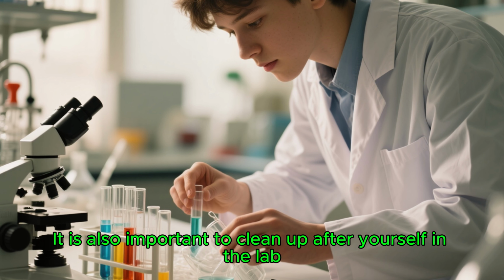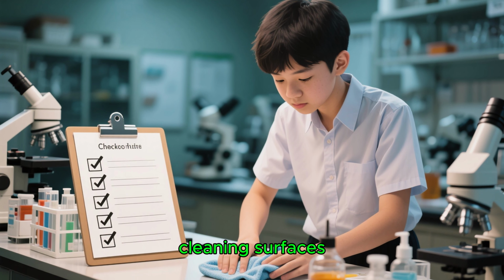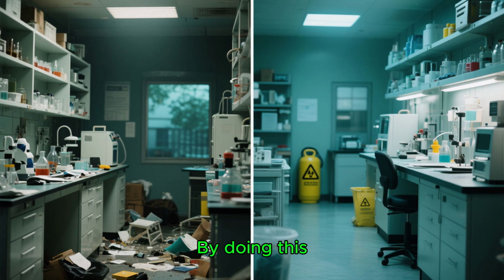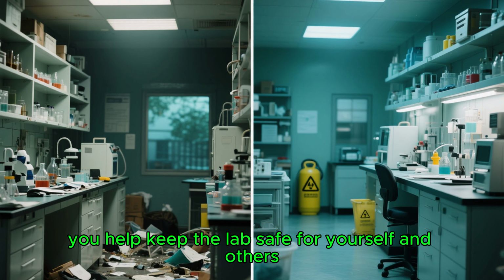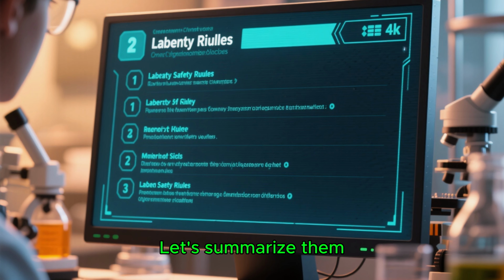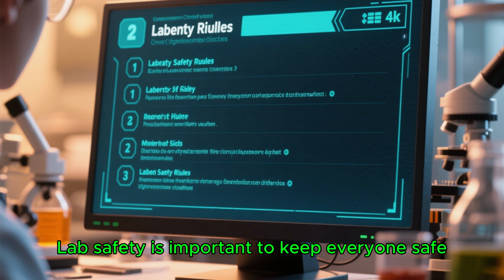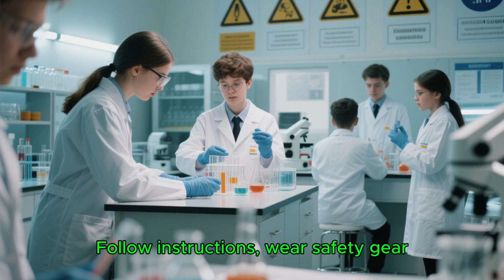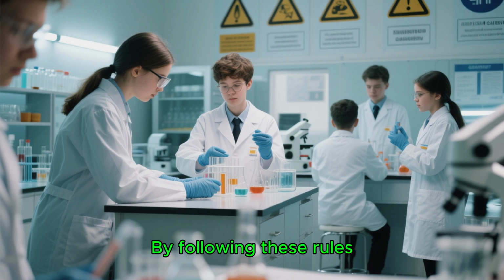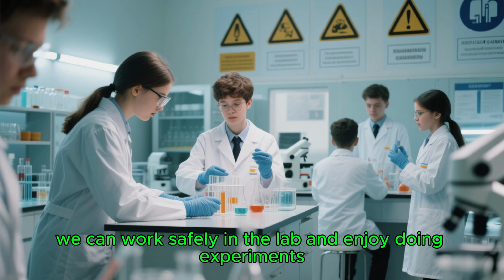It is also important to clean up after yourself in the lab. This means putting away equipment, cleaning surfaces, and disposing of waste properly. By doing this, you help keep the lab safe for yourself and others. We have seen many rules related to lab safety. Let's summarize them. Lab safety is important to keep everyone safe. Follow instructions, wear safety gear, avoid eating or drinking, and handle chemicals carefully. By following these rules, we can work safely in the lab and enjoy doing experiments.